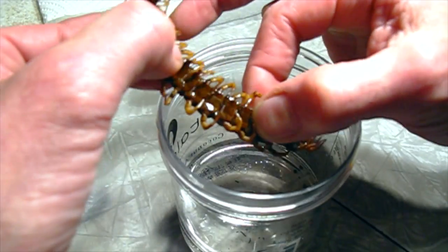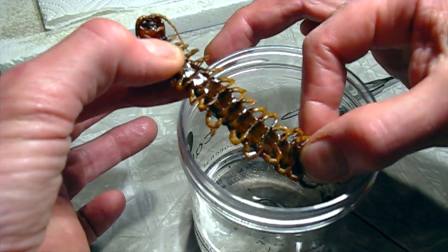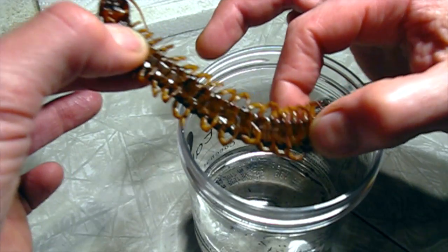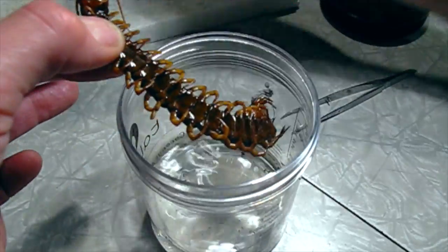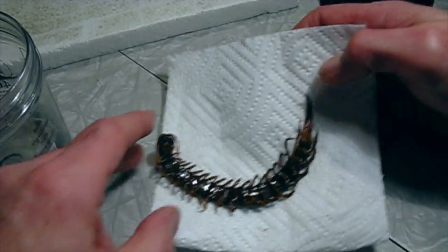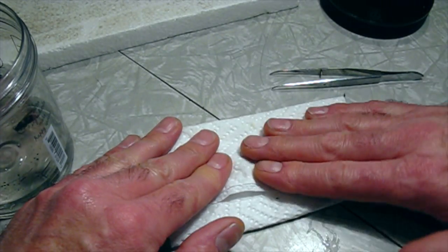Now it's fairly large, but I don't know if it's going to need to be stuffed or not. A really big one, I think you'd want to pull out the guts and stuff it like you would a big arachnid. But I'm going to size this up. It actually feels pretty firm. I think we might get away with just being able to pin it up. So I'm going to put it on some paper towel here and try and get some of the alcohol out of it, just to make it a little easier to work with.